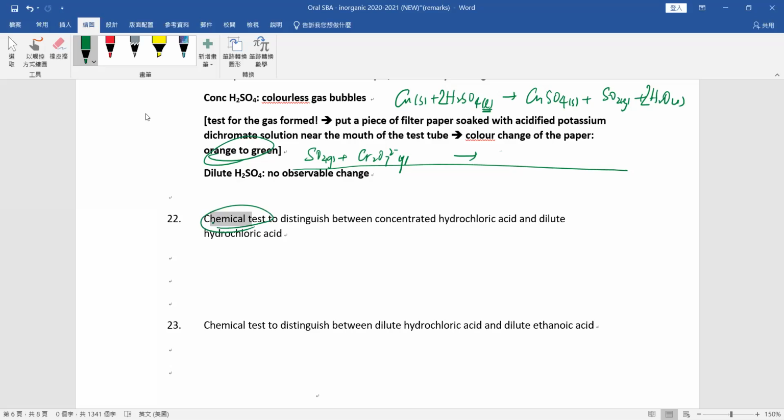Concentrated ammonia. Elaborate more on that. Yuan Tin Yao suggests adding a piece of magnesium and looking at the initial rate of reaction. Yes, possible. Both will behave similarly in a chemical way, but the difference is about the speed.